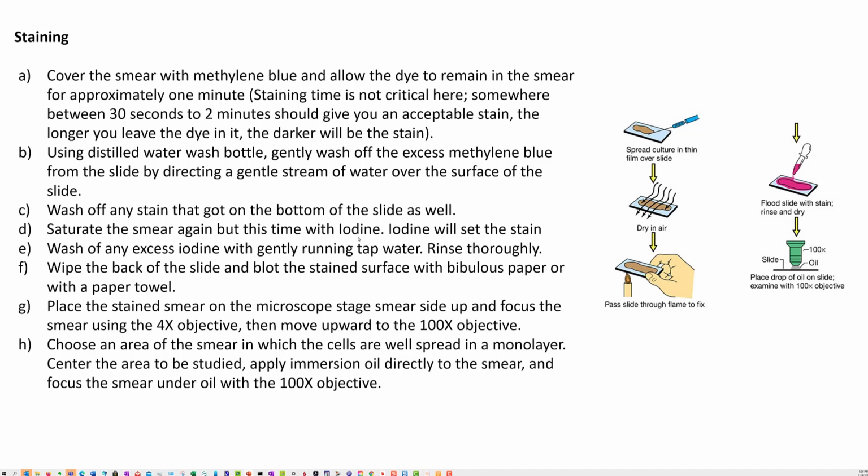In other words, it helps keep the original dye into the membrane. So the idea behind that, of course, is to make sure iodine is there for a period of time. I think 30 seconds is enough. Then you can run just gentle tap water on the surface to gently rinse it, and then you can use bibulous paper to blot off.